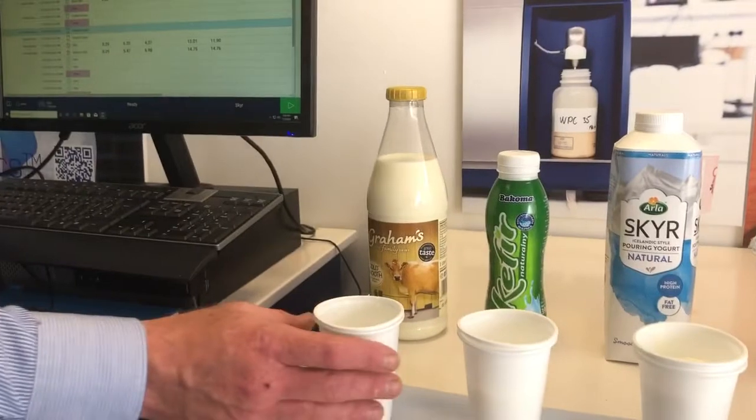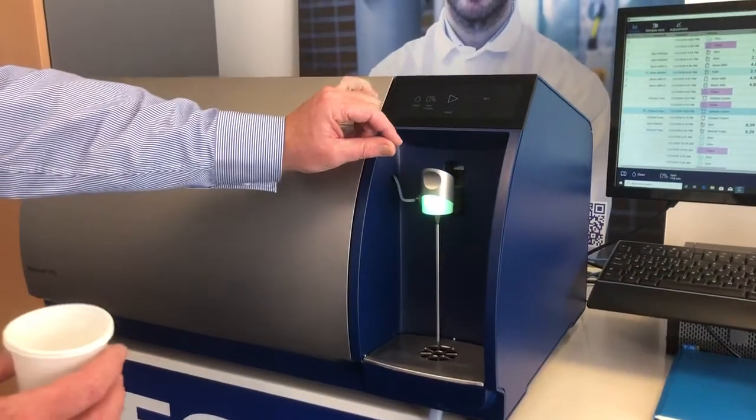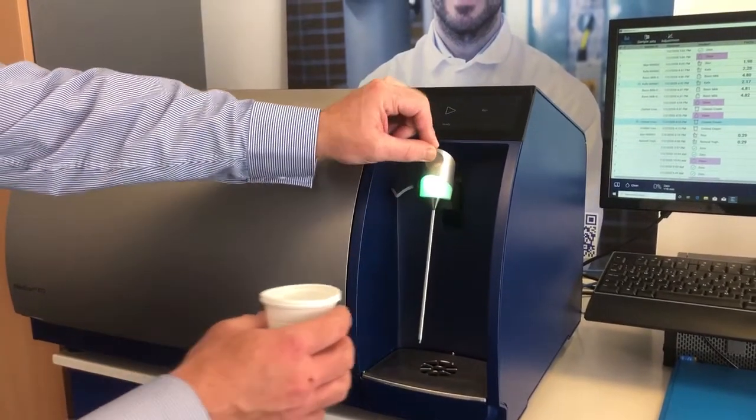We'll take a milk sample — the usual 50 to 100 mils of sample in a plastic container — and lift the pipette as normal.